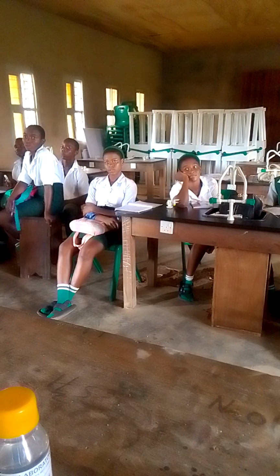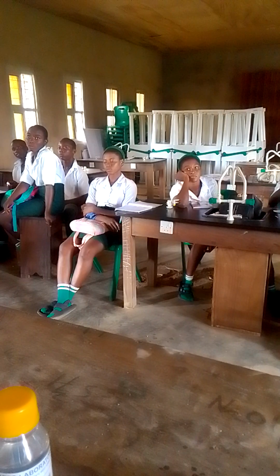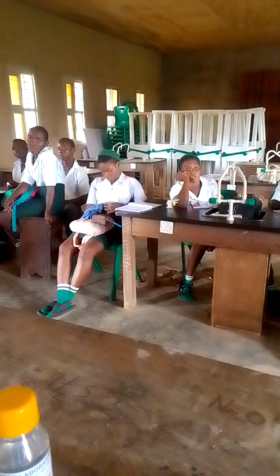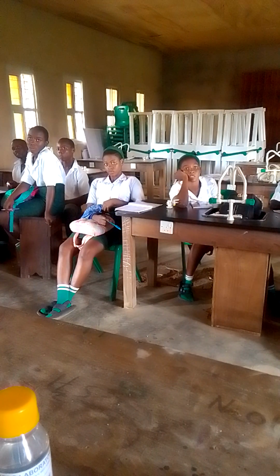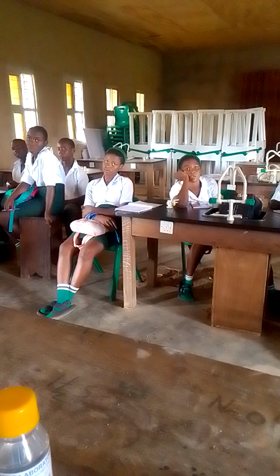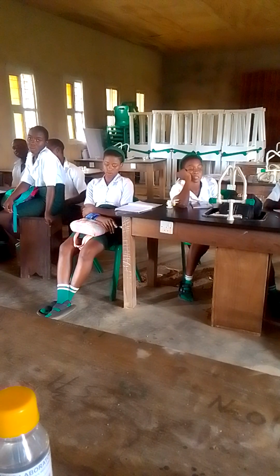Now you're going to follow the instruction. First of all, the specimen D, which you have there, is a compound of iron 2 tetraoxosulphate. Then you mix it with water and test it with litmus paper. When you mix it with water, in observation, you write what you see there. Then you test it with litmus paper, you write what happened there. Then at inference, you tell us if that compound is totally dissolved or partially dissolved. Is it clear? That's what we're going to do.